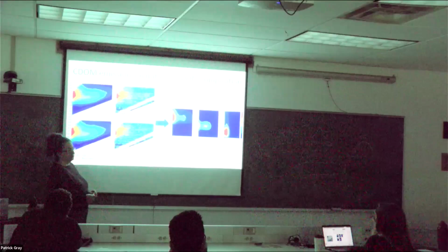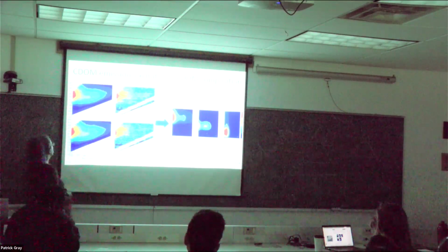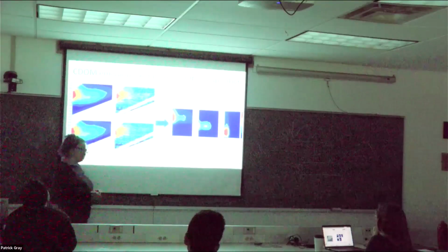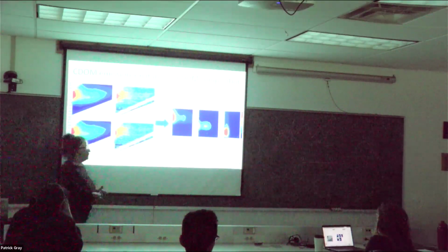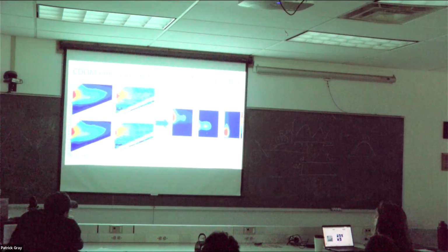I might have missed this because I got distracted reading the paper, but what is the unit that you would have as the color bar? Usually the color bar is in Raman units. You can correct me, but they usually use Raman units here for the excitation emission spectrum. Quinine sulfate is the standard. So you would use a standard.